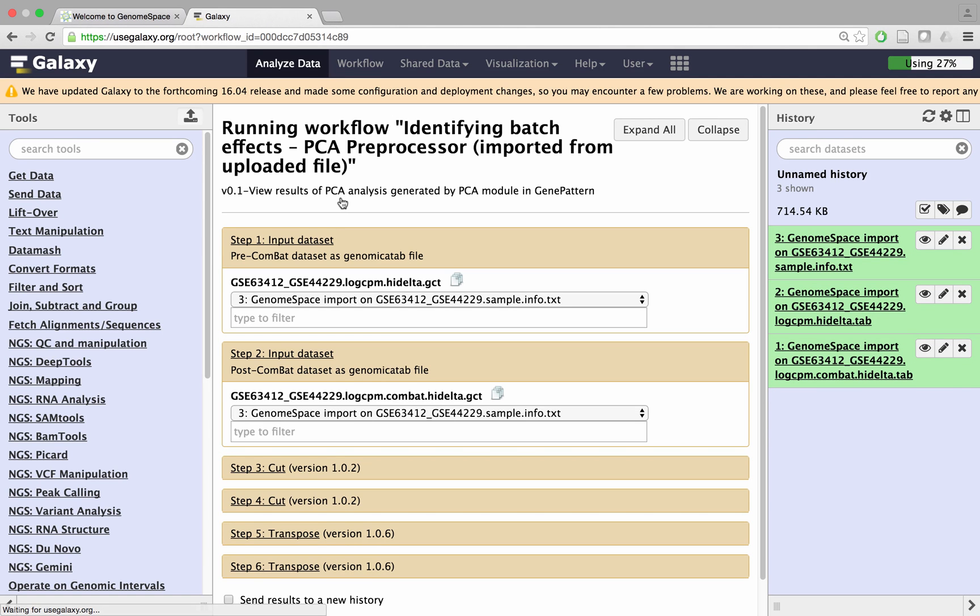Choose input datasets to the workflow from the drop-down menus, just as you would for a Galaxy tool.